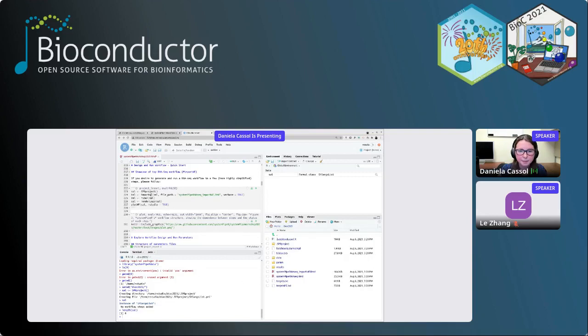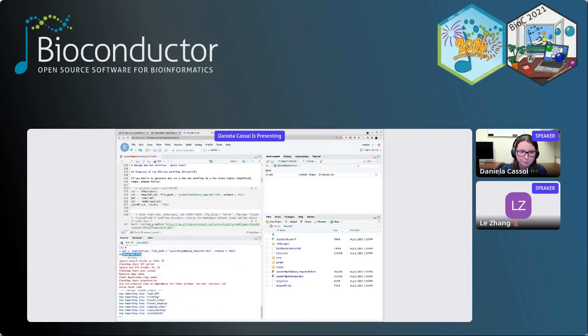So the second thing we are doing is importing the workflow. The entire workflow is in this R Markdown file. I'm using this function, passing the sal object we just created, and we are importing and generating the workflow from this R Markdown file. So when I click here, I'm running that line. You can see a few things happening down here. First of all, we are reading the R Markdown file, and then we are importing several steps.